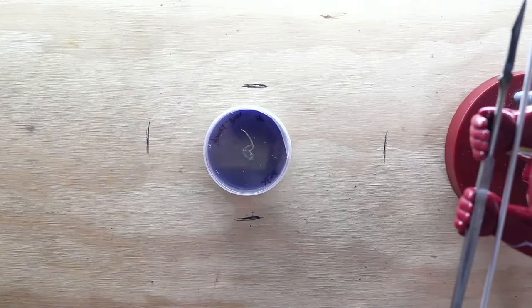I'm kind of at a loss as to what even to start with or to say. Well, you could probably start with what you plan on working with, like what strains we're going to work with tonight. Yeah, absolutely. So we are working with the one pictured there. That is a honey mushroom brought about by spores.